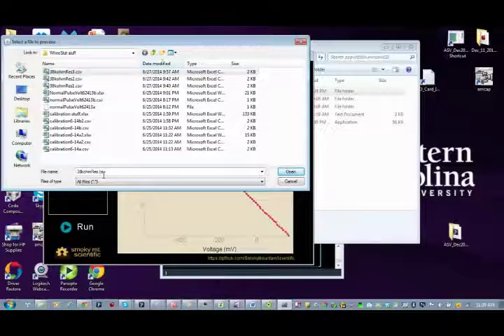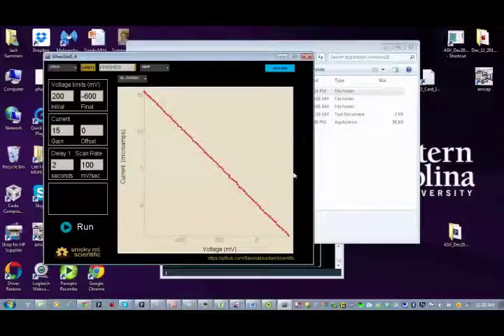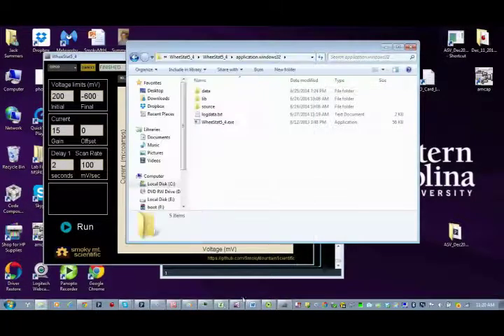This is 38 kilo ohm resistor, and we'll say that this is file number 4. If we call it a CSV file, then there will be no question about what it is when we go to open the file up. Unfortunately it's got a button that says open, but actually what it does is it saves.